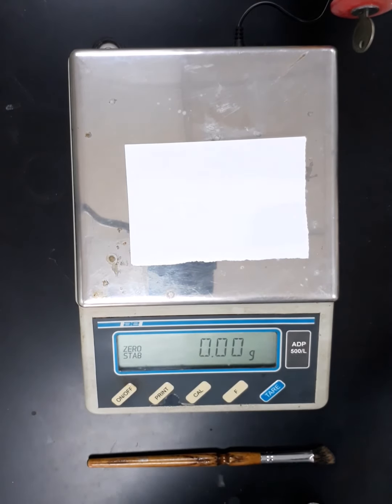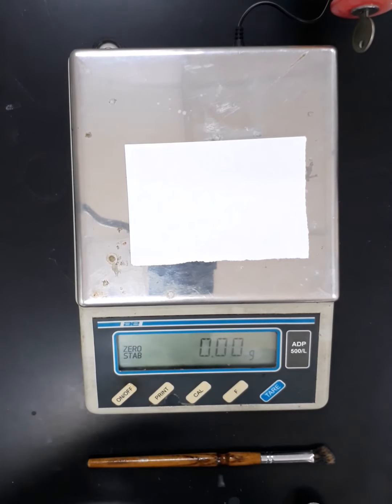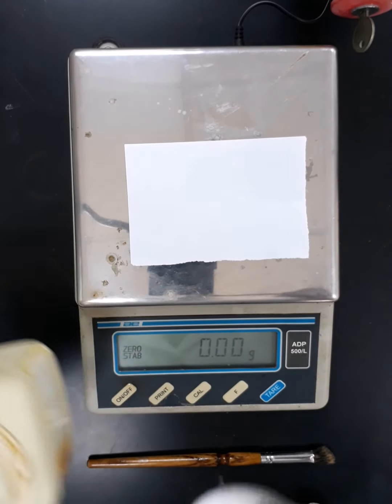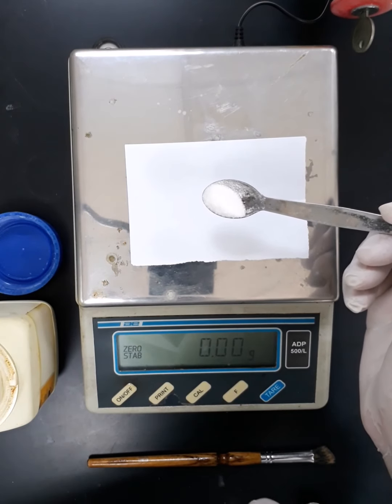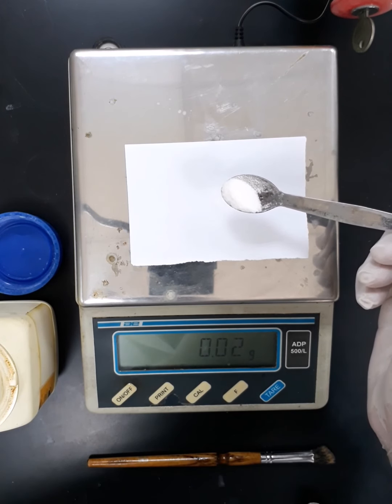Now we are going to prepare the glycine solution. So we will take the spatula and we will take 0.25 grams of the glycine powder. Gently we are going to add that, and we will try our best not to exceed the desired quantity.